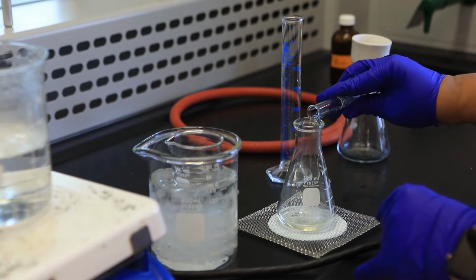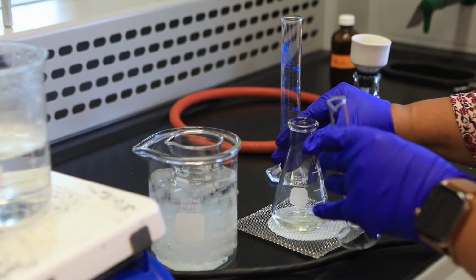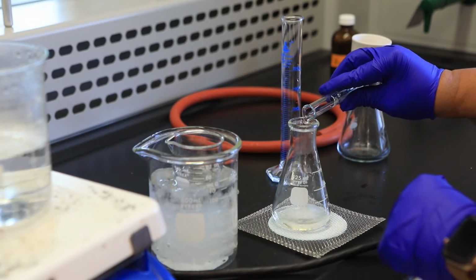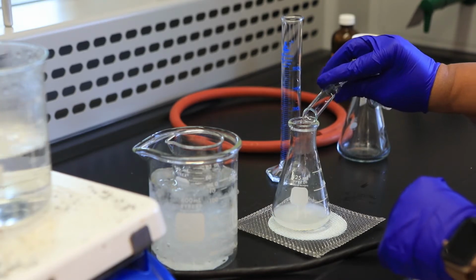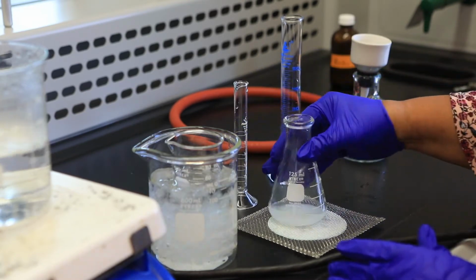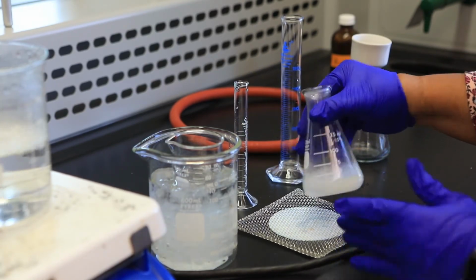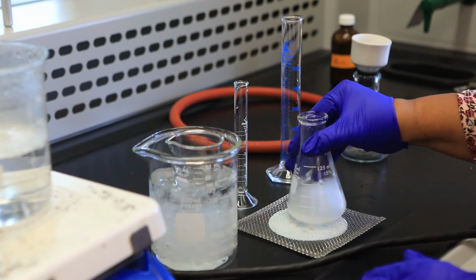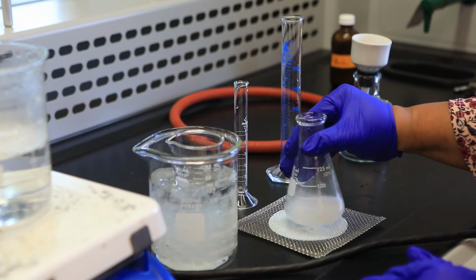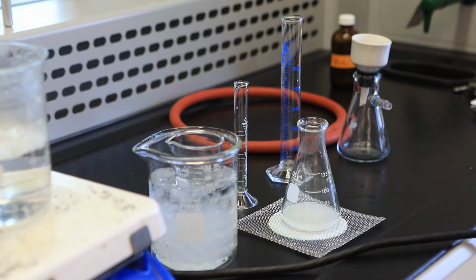This will also eliminate any acetic anhydride that is remaining and convert it to acetic acid. I'm then going to allow this to cool and then continue adding H2O just to break it up.